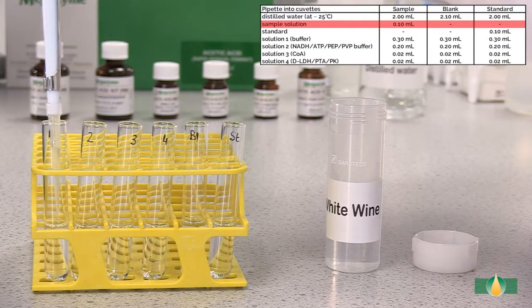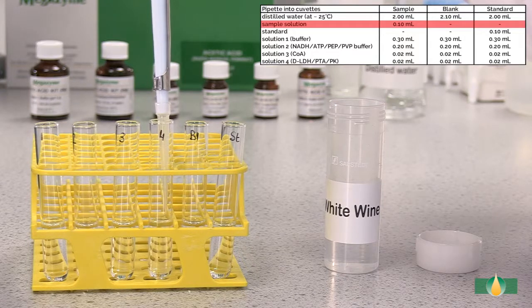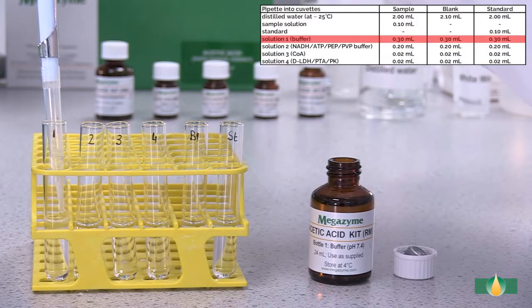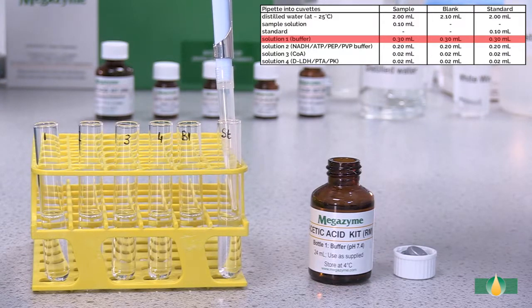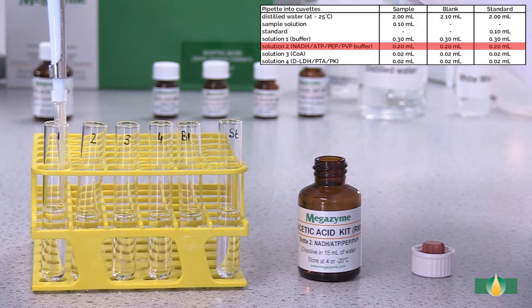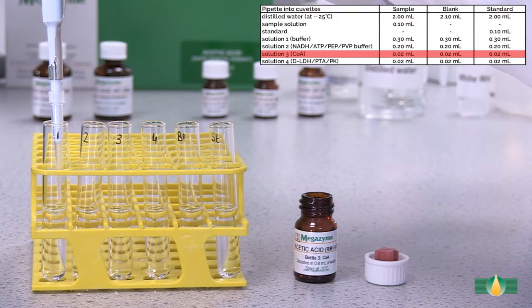Add 0.1 milliliters of sample to all sample assay tubes. Add 0.1 milliliters of kit standard, bottle 6, to the standard assay tube. Pipette 0.3 milliliters of solution 1 into all assay tubes. Pipette 0.2 milliliters of solution 2 into all assay tubes. Pipette 20 microliters of solution 3 into all assay tubes.